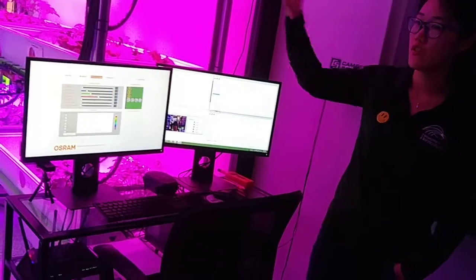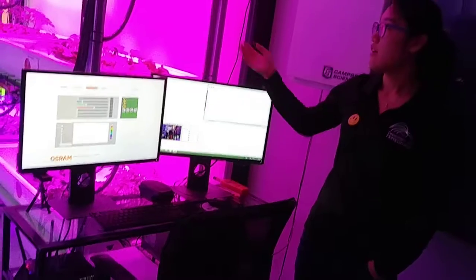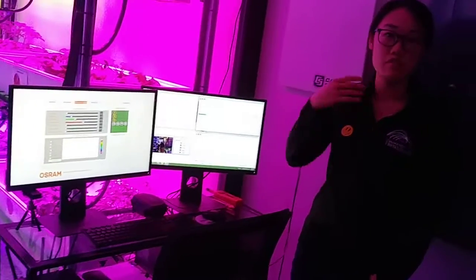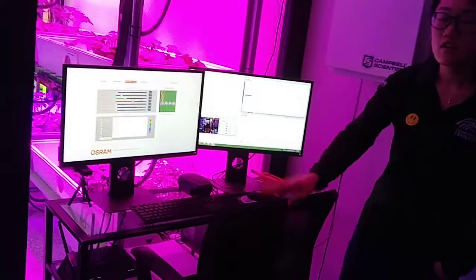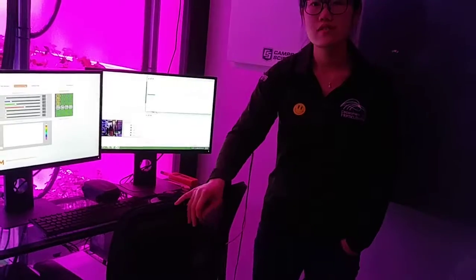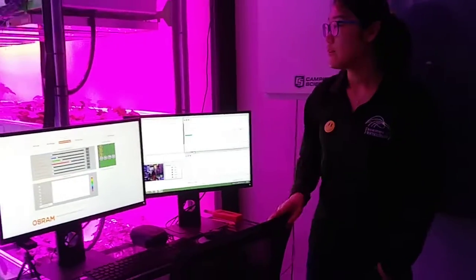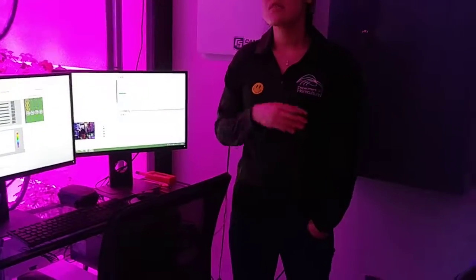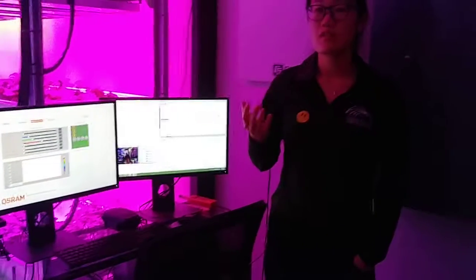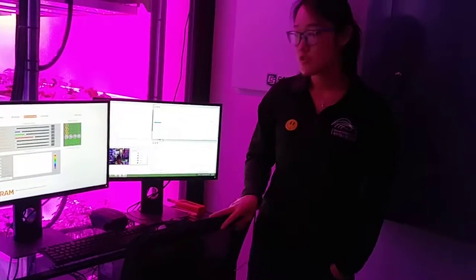The temperatures for those two rooms are set. The first room is set at 66 Fahrenheit, and the second room is 75 Fahrenheit. I'm sure you feel that when you walk through these two rooms. We recently bought a humidifier to increase the humidity a bit, especially during the dry season, for example, winter and especially now during the spring. For CO2 concentration, currently we cannot control it. We can only monitor it. But we will definitely improve that in the future.